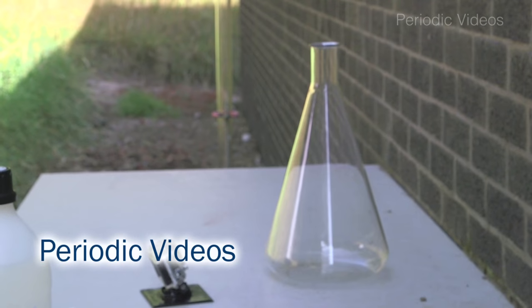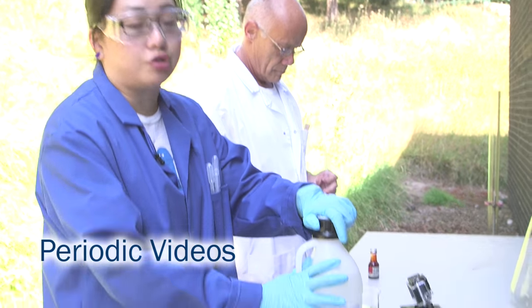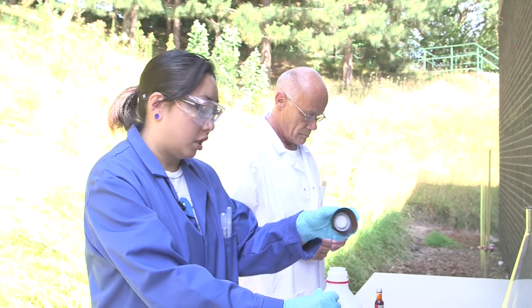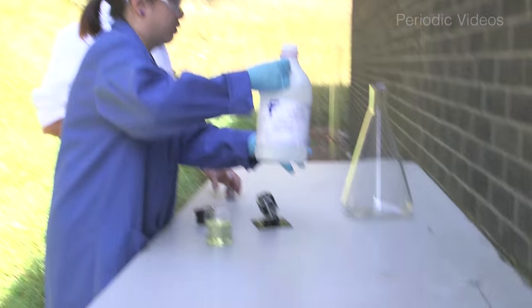We're going to do a very well-known experiment called the elephant's toothpaste. We're using concentrated hydrogen peroxide as you can see. We're going to put some of that in our five litre conical and then I'll explain the rest as we go along.